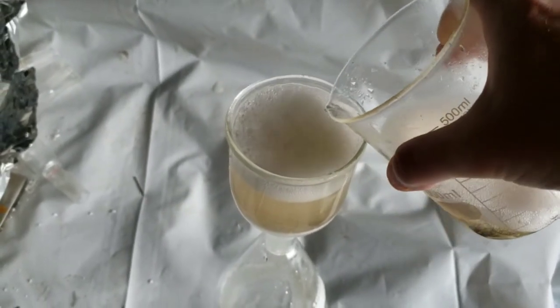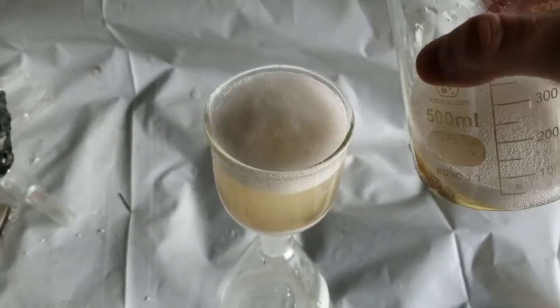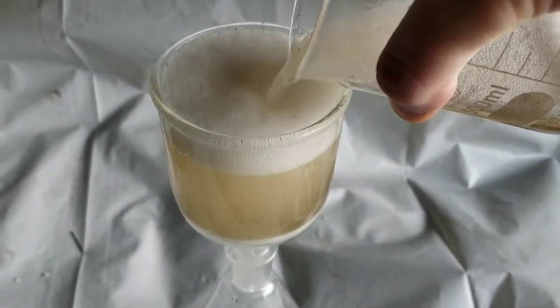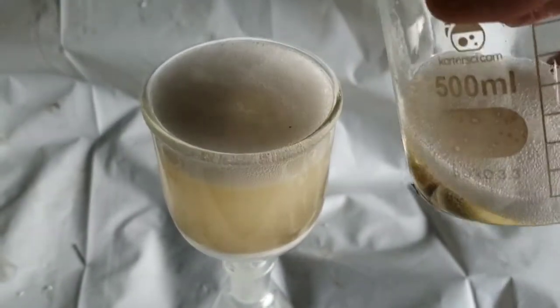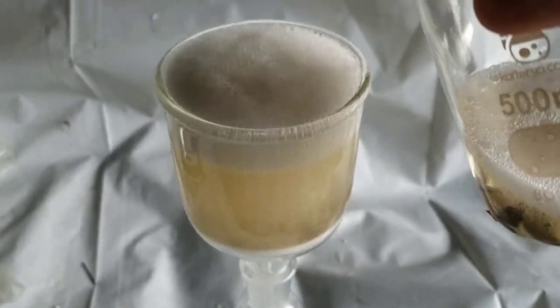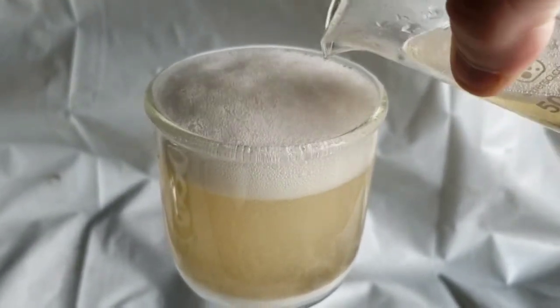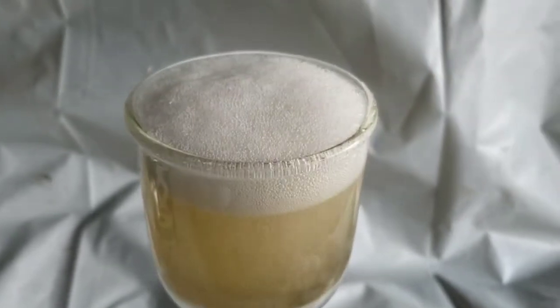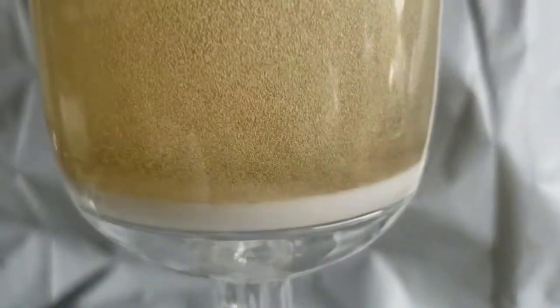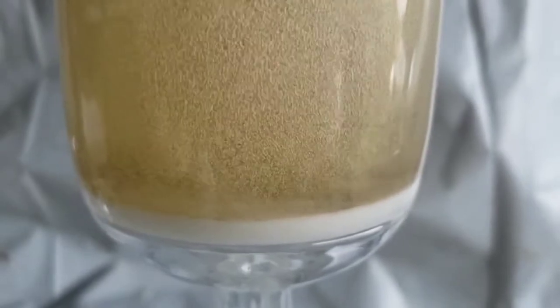Thank you. What's happening here is the piranha solution is attacking the carbon which is clogging the frit.